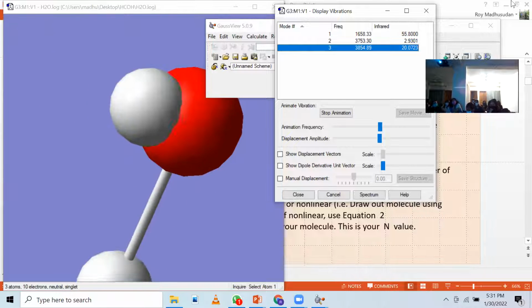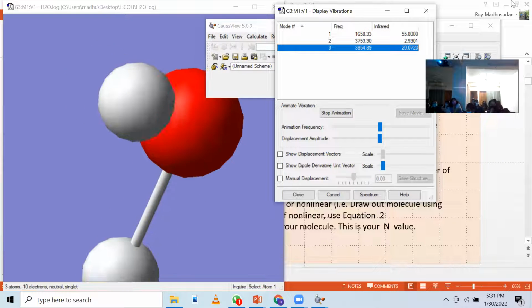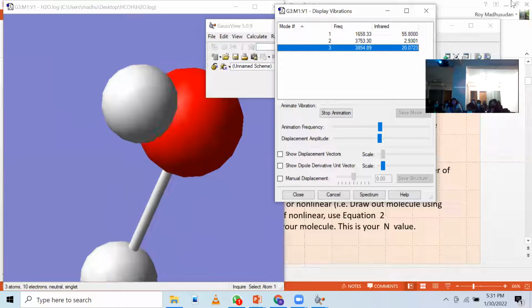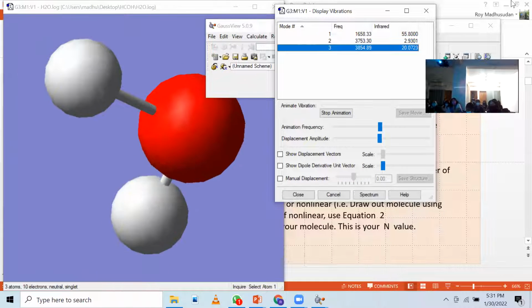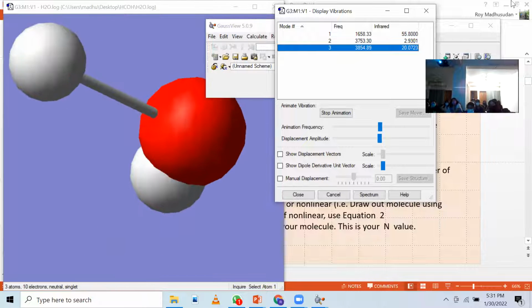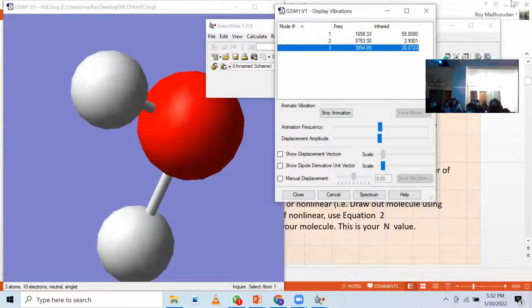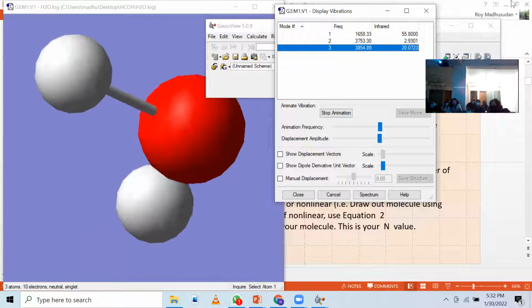Yes, you need to think about the polarity, what I have mentioned: if the atoms in the molecule are partially charged, that means if it has some partial polarity, positive charge or negative charge, whatever. So for this type of molecule, it is not a very good way to show it as polar. However, it is very less polar, because to know the polarity, if the atom in the bond is polar, you need to know the electronegativity.